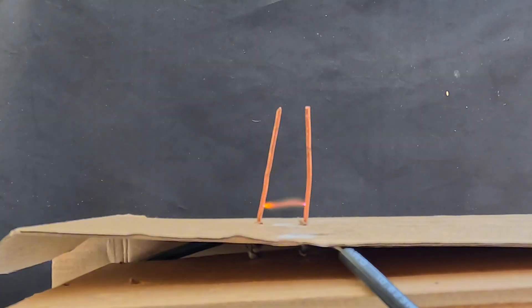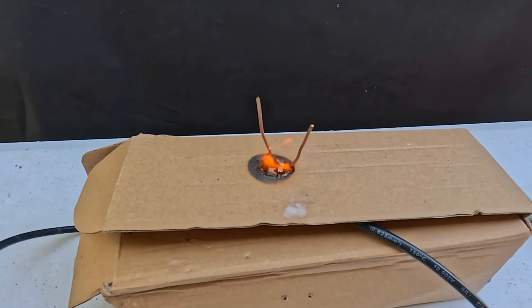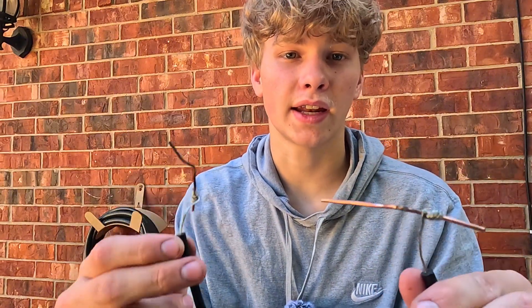Never have this thing on while you're running it — only once you have it completely set up, then plug it in. Now just plug it in and turn it on, and we're left with an arc of electricity, which is exactly what we need. Make sure not to run this for too long because my setup caught on fire. So we've achieved plasmifying the air, which brings us to the next step to make nitric acid.